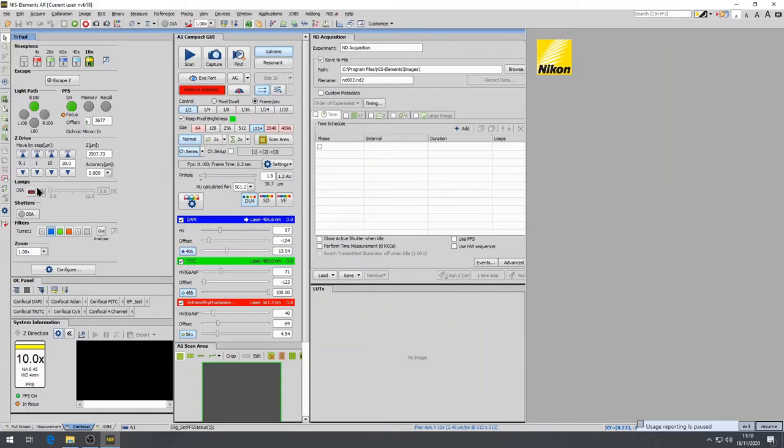In this system there are red, green and blue filter cubes installed for visualizing the samples and a zoom underneath.